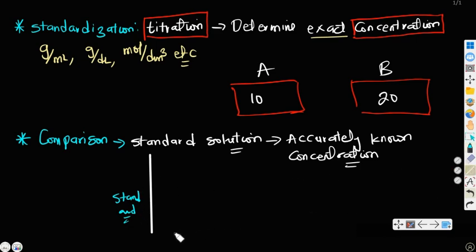Now if I take something here and then take it to half of this, without me telling you the height of this, you should be able to determine the height of this one from this. True or false? Why? Because you know that this one is what? 5 centimeters. This one is accurately what? Known. Now when you compare it with this one, this height here is like half of this. True or false? So if this one is 5 centimeters, it means this one will be how many centimeters? 2.5 centimeters. Is that okay?